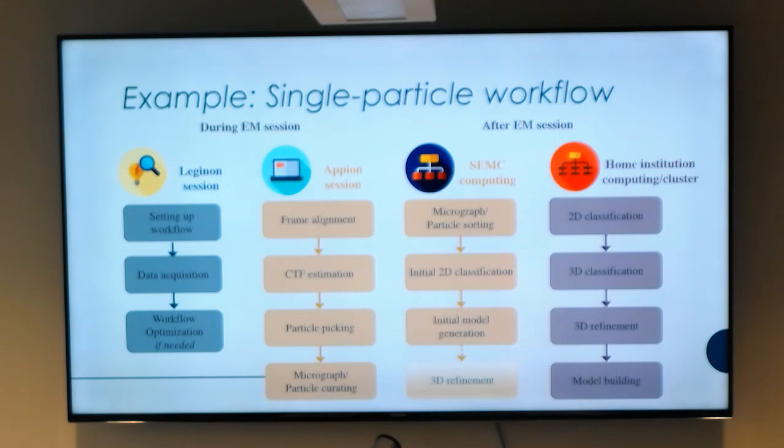And really, that is the best criteria. So if you're trying to sort out data, you eventually need 3D feedback, right? Because it might not be so apparent in 2D class averages if you have preferred orientation. It might not be so clear just by 2D classification if you have heterogeneity. Maybe you can tease that out. It really depends on your sample.